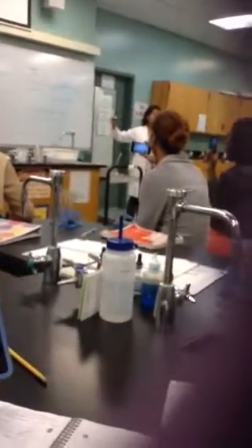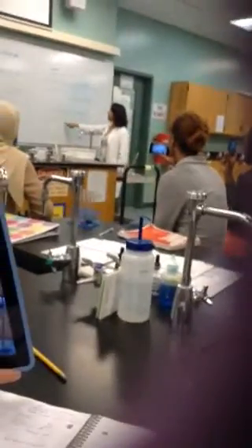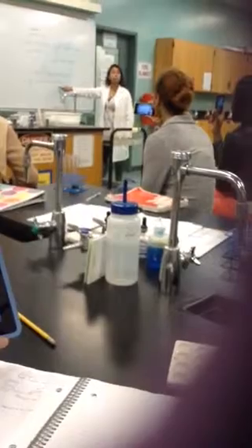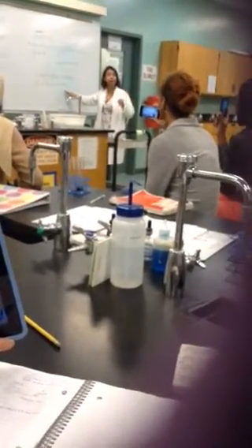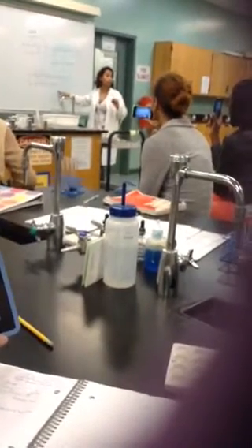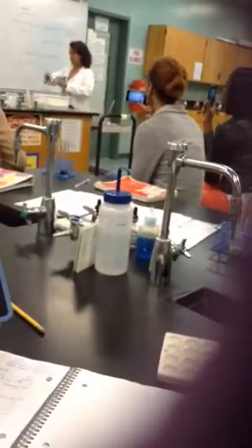So the starch would have been negative in the iodine test. However, for 5 and 6, you should have starch because it doesn't have amylase. So that should have been positive, nice and black and thick when you added the iodine, but negative when you added the Benedict solution. So that's for the carbohydrate. So, positive with iodine, negative with Benedict. You understand?